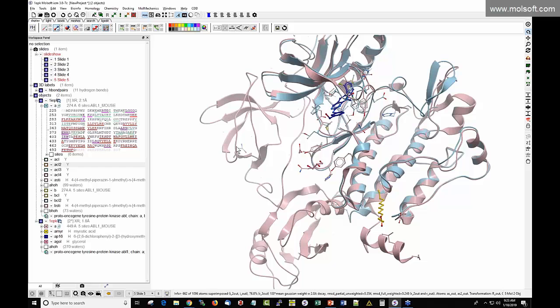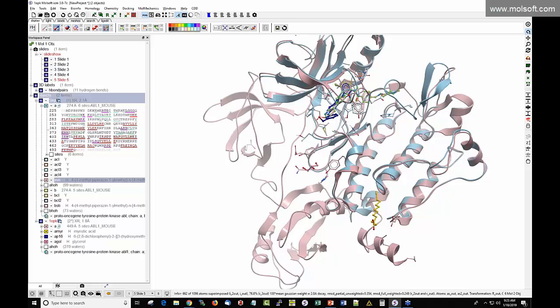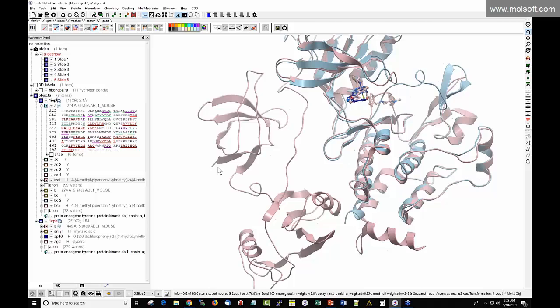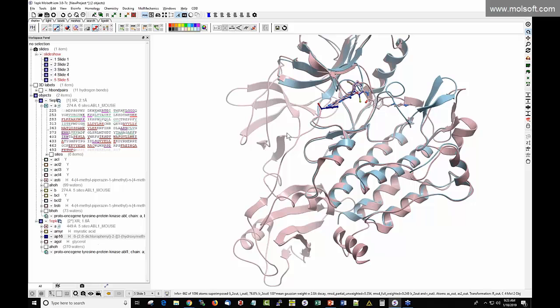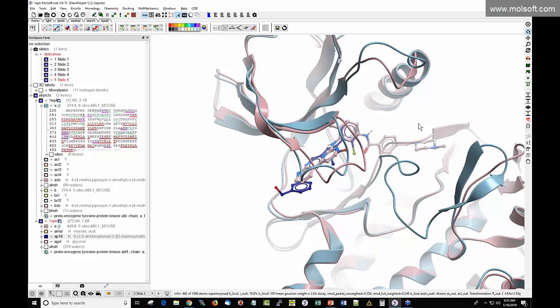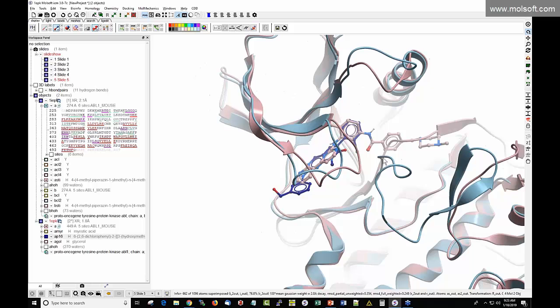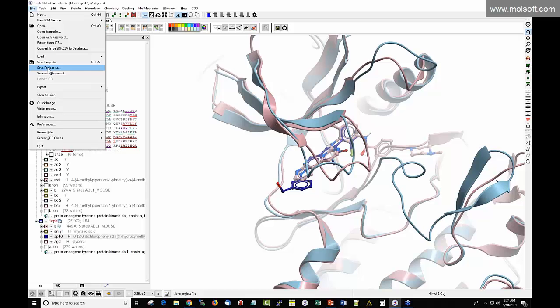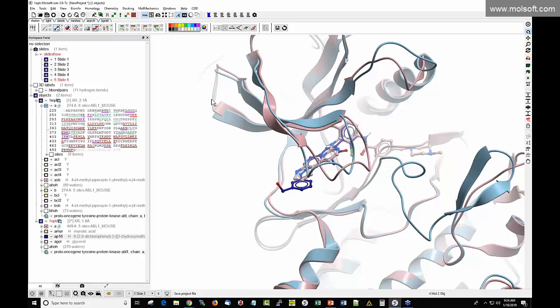Zoom in and display Gleevec and the ATP-site ligand from the other structure for clarity. You can see that in 1OPK the DFG region closes the ATP binding pocket (DFG-in), while in 1IEP the DFG comes out (DFG-out), creating the larger pocket where Gleevec binds. When you've spent time building these images, save everything with File > Save Project — this preserves all your slides and settings in ICM format.